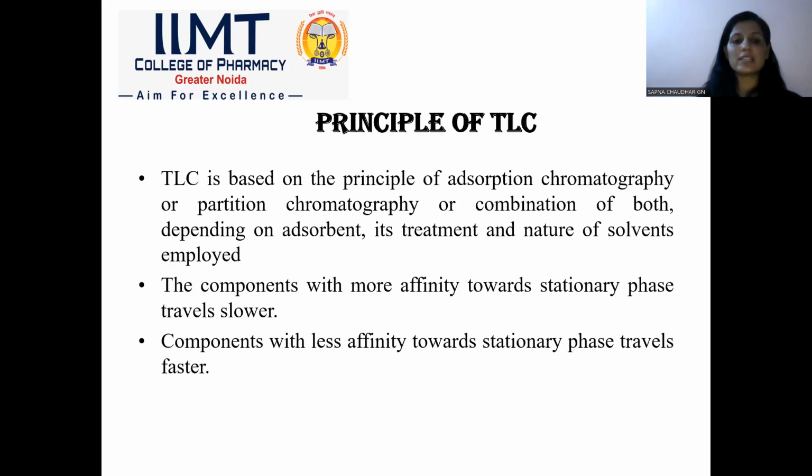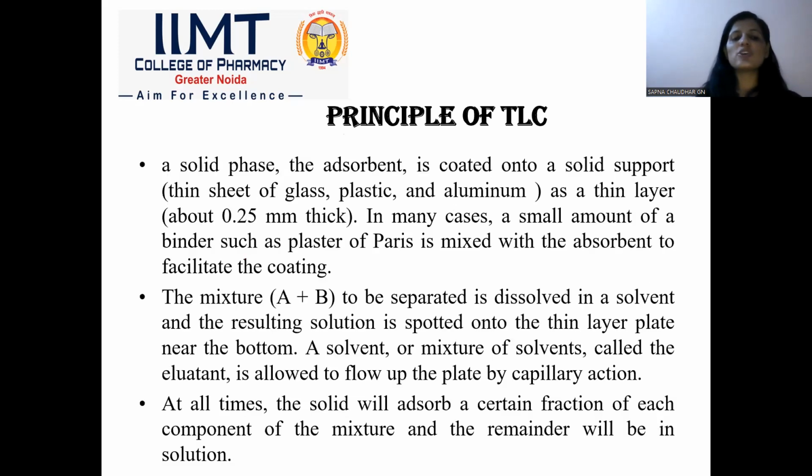Next, the principle of TLC. Basically, TLC is based on the principle of adsorption chromatography or partition chromatography. Adsorption depends on the nature of the adsorbent and the nature of the solvents employed. Components with more affinity towards the stationary phase travel at a slow rate, and those with less affinity towards the stationary phase travel faster.